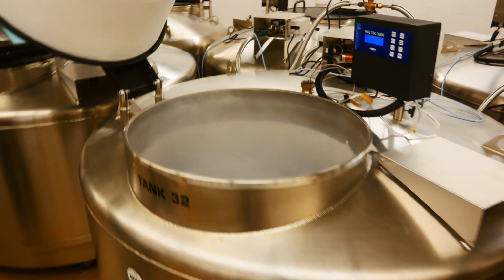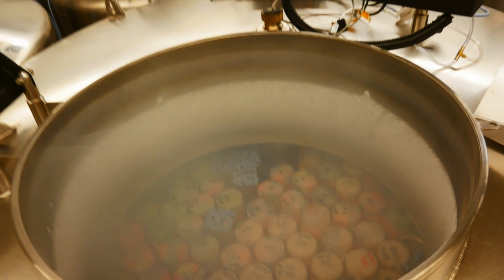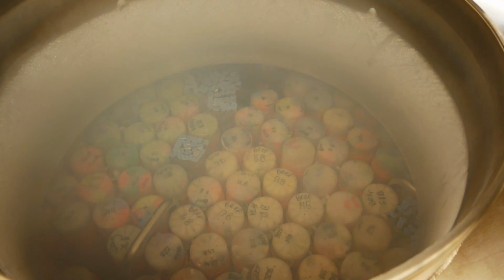And so you are storing some of those tropical species here, but using the nitrogen system as part of that? Yes. Because, and again, our research team is very important to this. We don't just get an avocado seed and drop it in. One, we have to have the data on it. But two, we have to cool it appropriately so that we avoid water crystals from forming, because that's the killer on cells. If ice forms, if water freezes, then it creates sharp crystals that destroy the integrity of the cells. And our researchers here have, I think some things are easy. Corn might be a crop that you stick in the freezer and it's going to live.